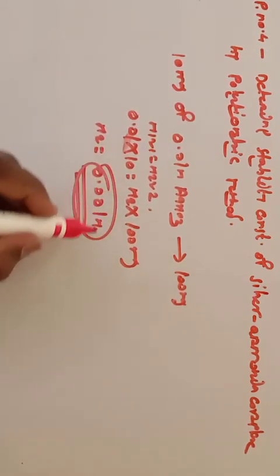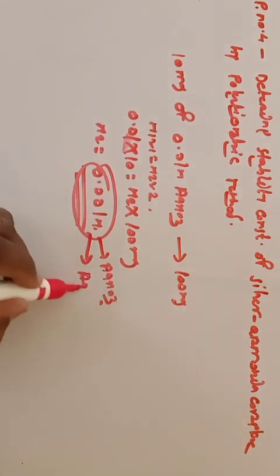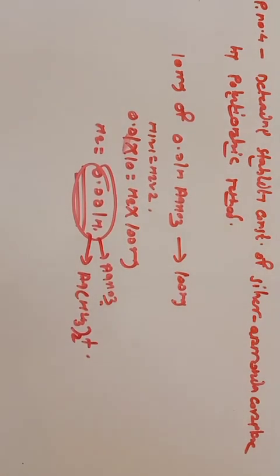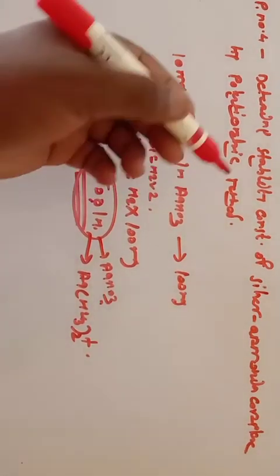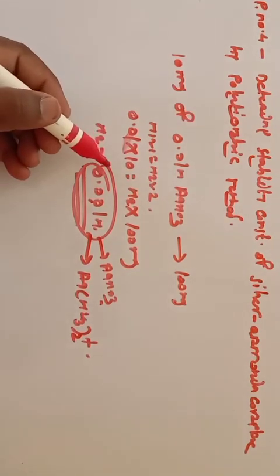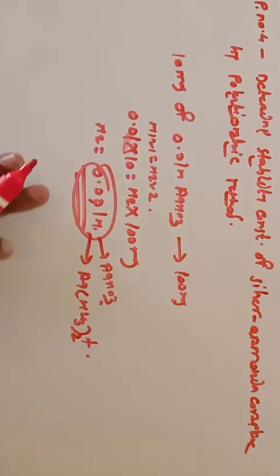This is the concentration of the AgNO3 solution, and also the concentration of the silver ammonia complex. Because we take the same volume of silver nitrate in each flask, the concentration of this silver ammonia complex is the same; it does not vary with the volume of ammonia.